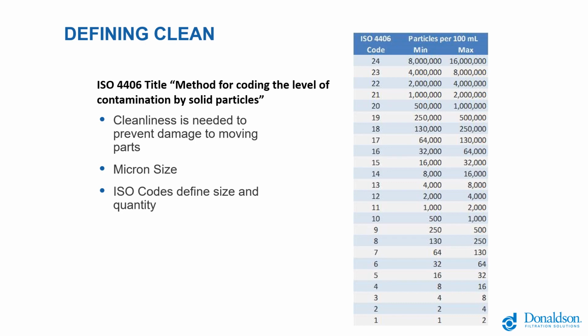So we described the particles as we showed before, of 14 microns and larger, 6 microns and larger, and 4 microns and larger. The first number in that code of a 4, 6, and 14 range is always the largest, and you have less and less as you count only the larger particles from there. And we'll cover that again.